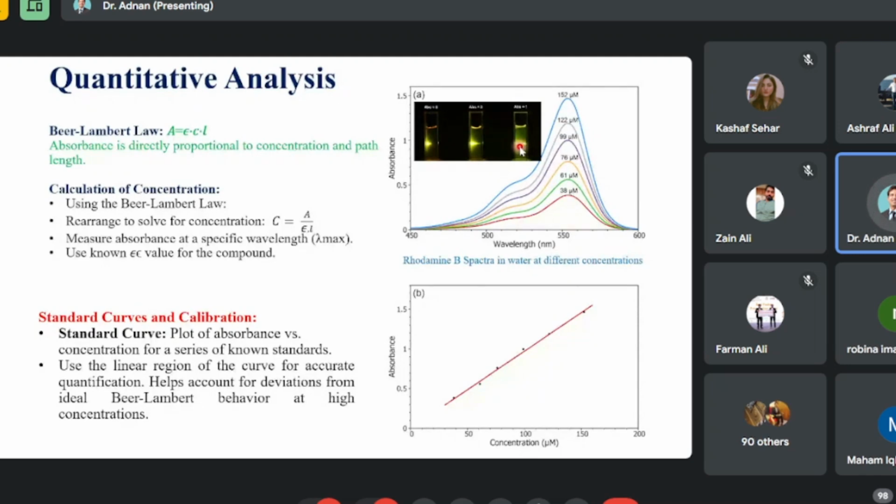The substance is unknown, but it is to tell you how the light is passing through certain samples and how it can be affected by the concentration using the Beer-Lambert law. For example, in absorption 1, the light is passing from one corner to another corner. And in absorption 3, when the concentration is increased, it can reach near the edge but cannot pass through the whole cell.